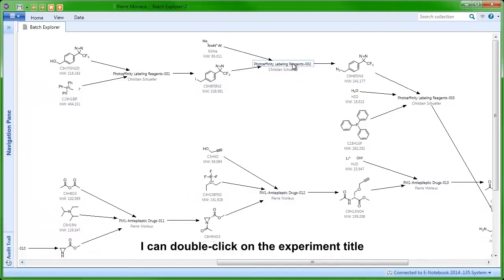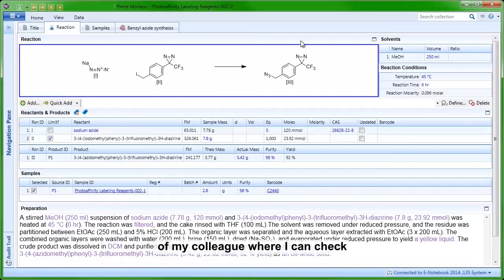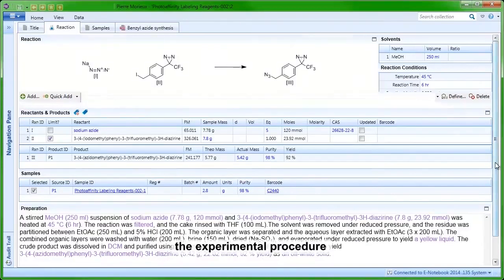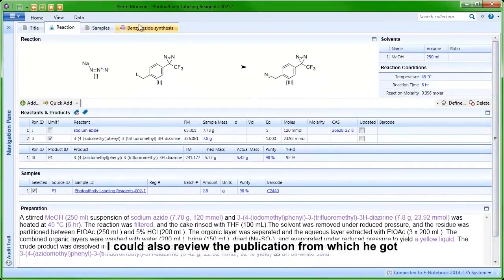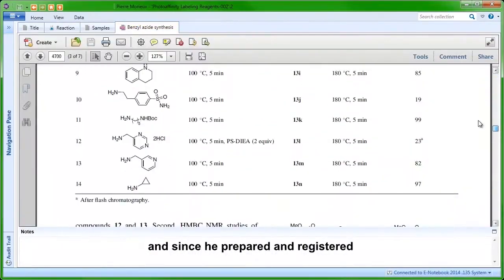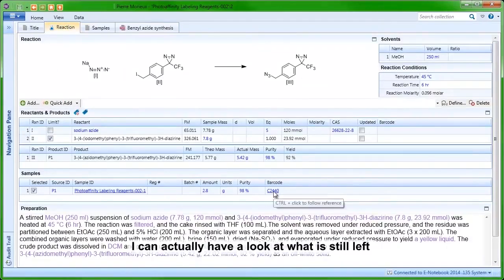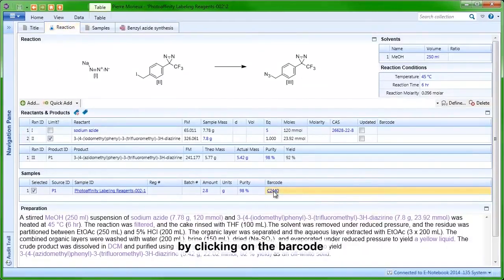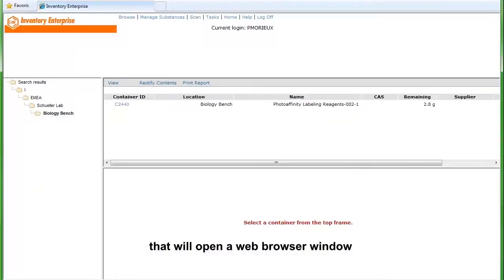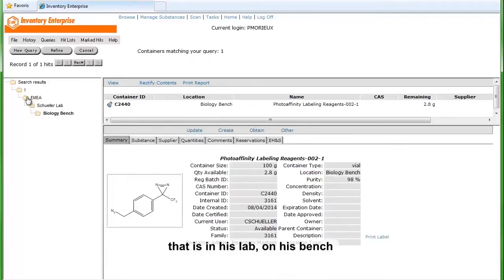I can have a look at that synthetic history as well. I can double-click on the experiment title, which will take me to the notebook of my colleague, where I can check the experimental procedure and also review the publication from which he got the procedure. Since he prepared and registered a certain amount of this compound, I can have a look at what is still left by clicking on the barcode, which opens a web browser window and takes me to the inventory location where that container is stored — that is in his lab, on his bench, and there are still 2.8 grams left.